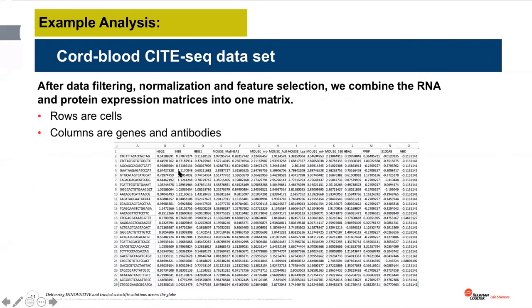And so right now, assume you run a Cytobank R script, or your bioinformaticians help you with filtering and normalizing your data, you will get a big expression count matrix. And here again, this is a screenshot of the matrix. One thing I would like to point out is that this screenshot will look different from the previous two, because here we transpose the matrix.